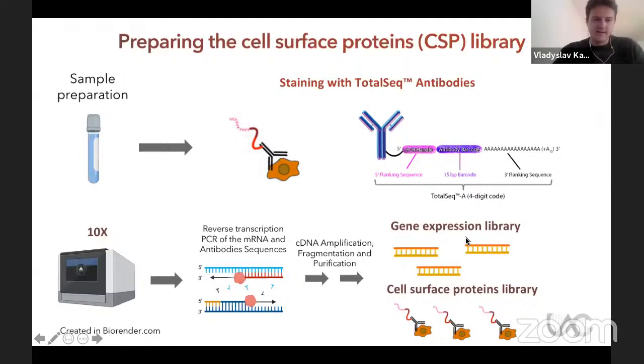What I have done with this data set that we will analyze today is trim it a little bit. I have left only a few cell populations, so the analysis is not too complicated for us today. And I downsized the sample to 2,900 cells. So that is what we are going to do today. Basically, let's dive into the practical part.